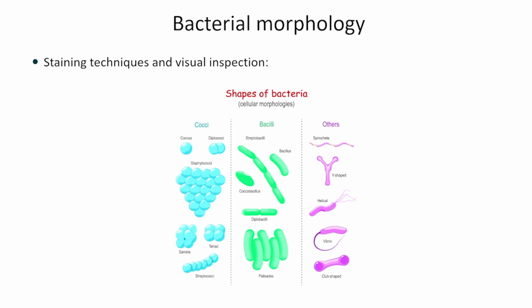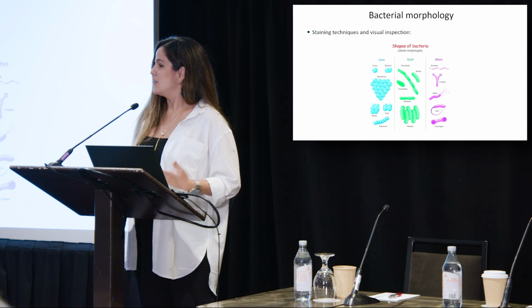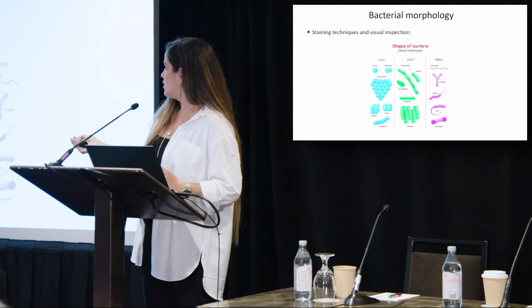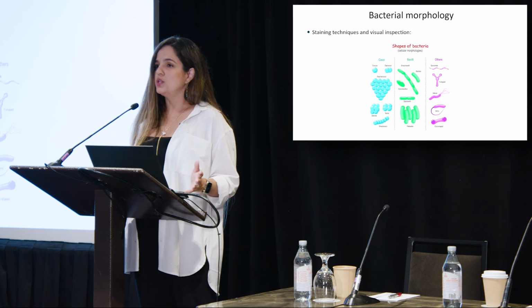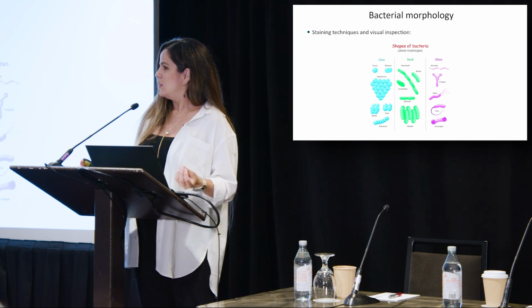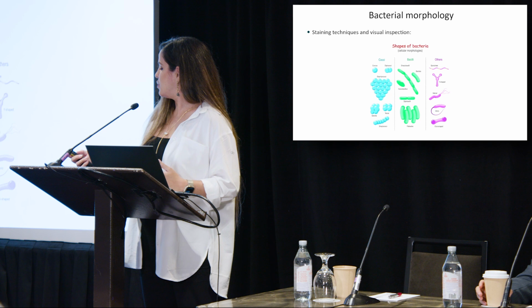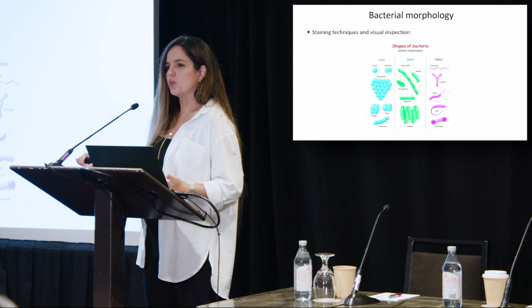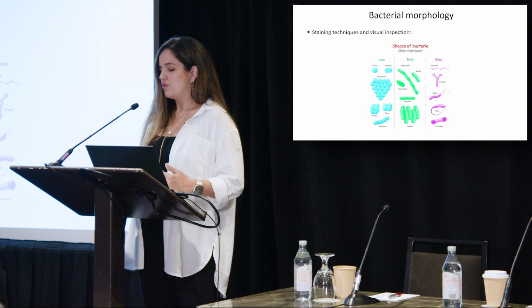One of the things that we can see is how they look. And this is very important to us. It's like understanding their shape: if they have a bacilli shape, like this one, if they have a cocci shape, like this one, or the Y shape, we will define what to do next. And a lot of these shapes are associated with specific pathogens and give us some information like, okay, it's potentially Escherichia coli, if it's a bacilli that I see colored red on the microscope, depending on which site we collect these samples from, right? And then we move on to the next step.